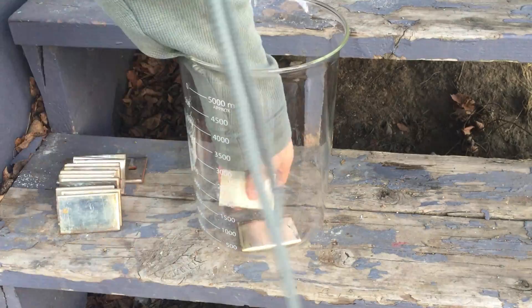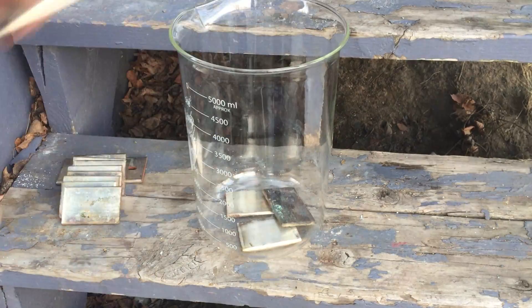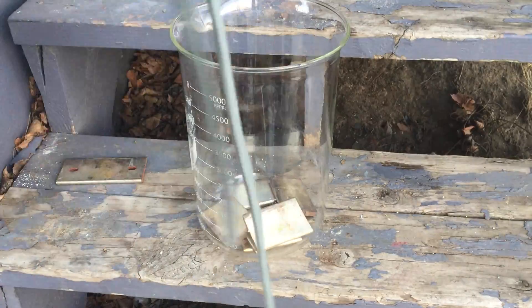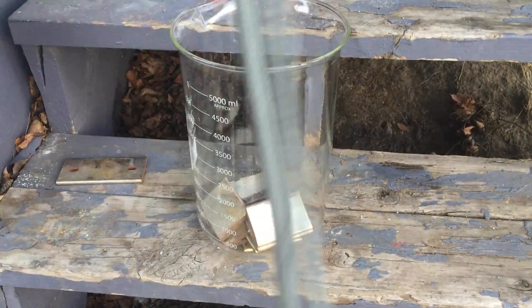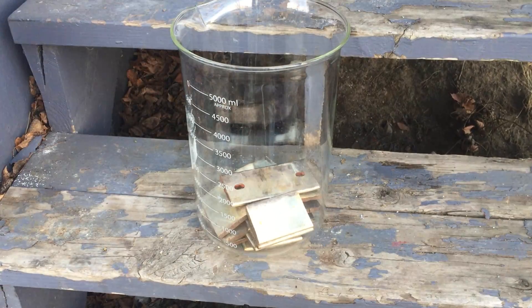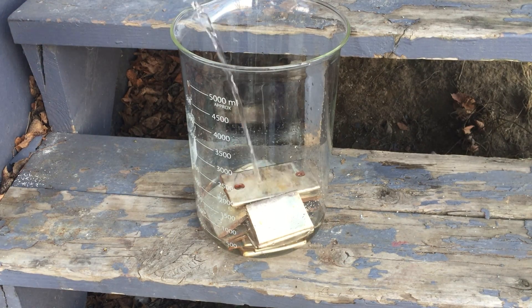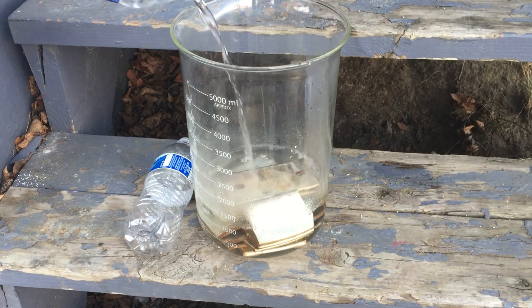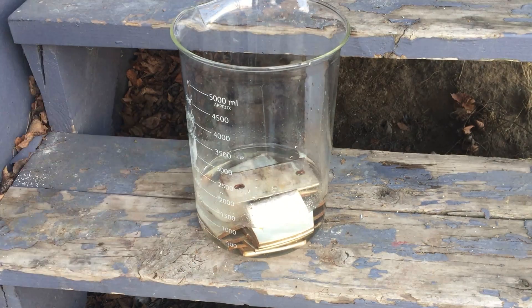The first step involves putting the copper bus bars in a deep container. Next the bus bars must be completely covered with water to ensure that all surfaces react. Then to the beaker a small amount of nitric and hydrochloric acid are added. I would also like to mention that the water bottles I used were empty before and I refilled them from the tap.